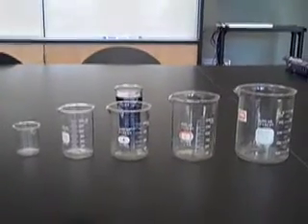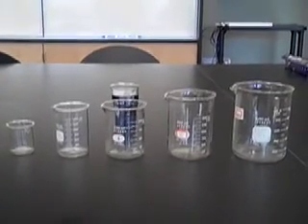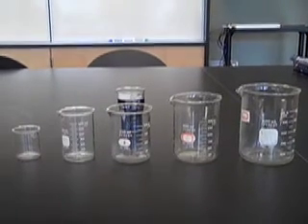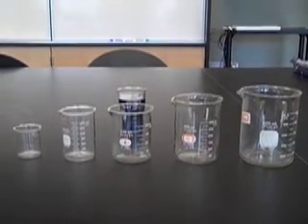We have 50, 150, 250, 400, and 600 milliliter beakers. You should always use the smallest possible beaker for the amount of liquid you have.